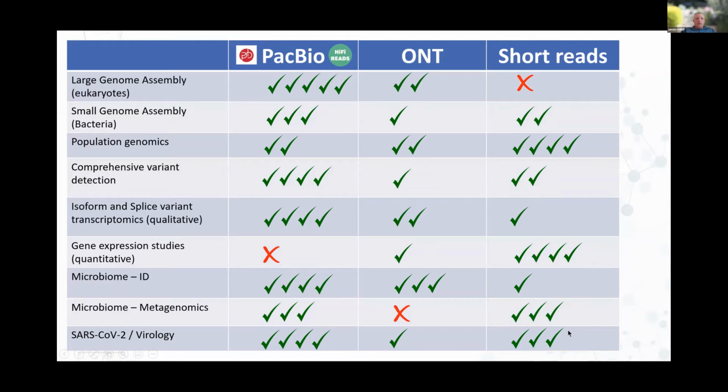All of the short read technology that's currently used for sequencing SARS-CoV-2 genomes relies on amplification of the genome using a set of primers that are designed to, I guess, more conserved spots in the genome to amplify up a whole panel of amplicons and then sequence them. And you do get dropouts. There are multiple versions of these panels being produced, and I'm sure that an Omicron panel will come out soon. But you have to question whether the next variant that comes along, which we know will come along, is going to need another panel to be built.